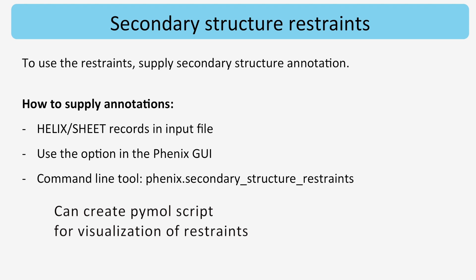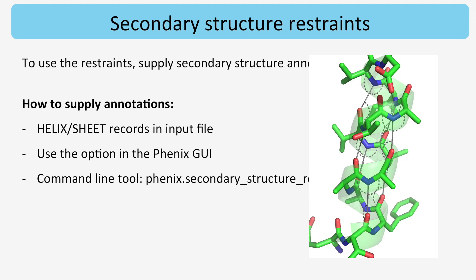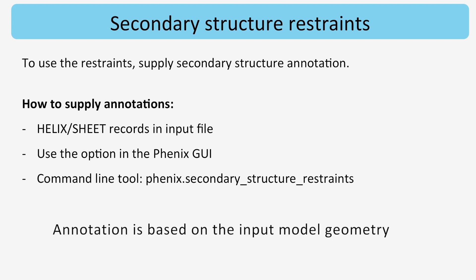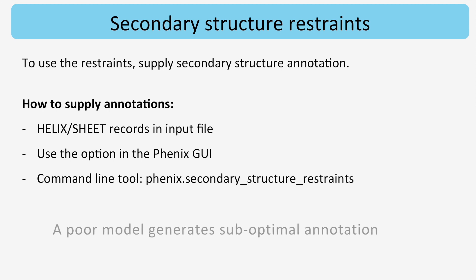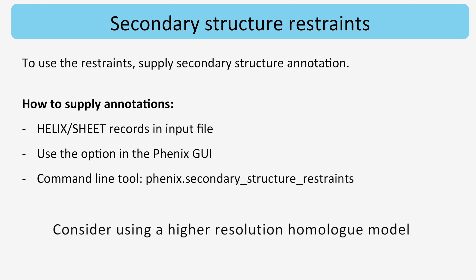There is also an option to create a PyMOL script, which allows visualization of bond and angle restraints to be applied, such as in this helix. The algorithm in the GUI and in this tool is the same. It should be noted that secondary structure annotation is based on the input model geometry, so a poor input model is likely to generate a suboptimal annotation. If a higher resolution homolog model is available, consider using it for generating the annotations.